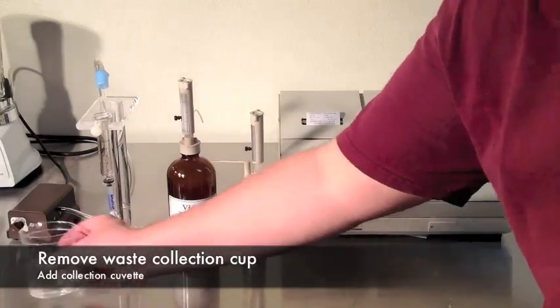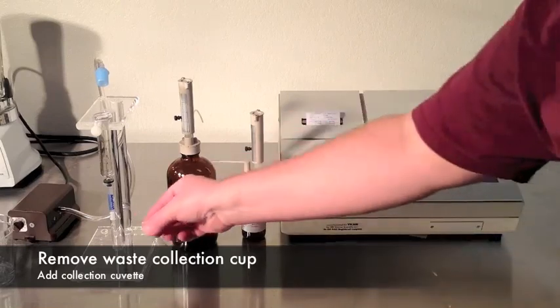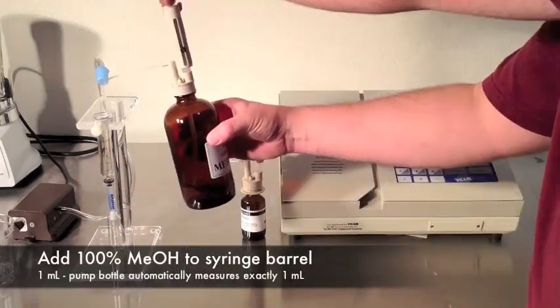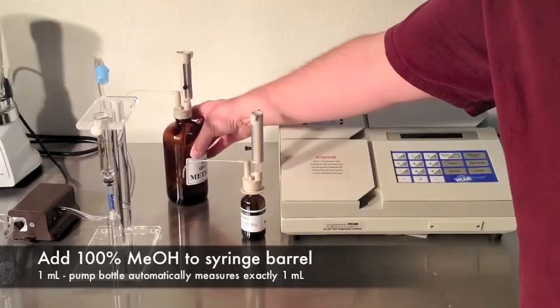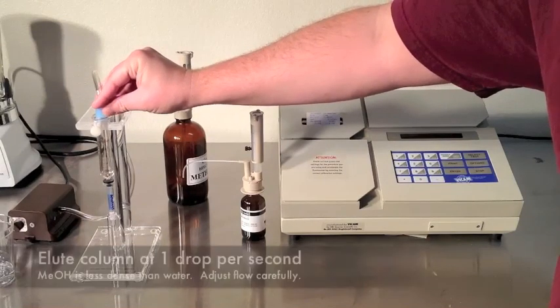Remove the waste collection cup. Place the collection cuvette below the column. Then add one milliliter of pure methanol. Very carefully, pass one drop per second through the column. Methanol is less dense than water, so it will flow quicker than your last steps.